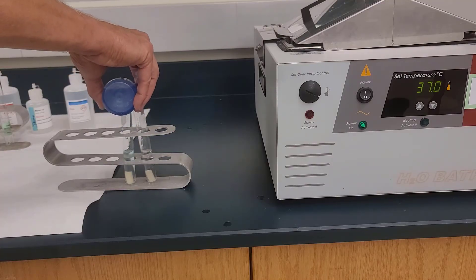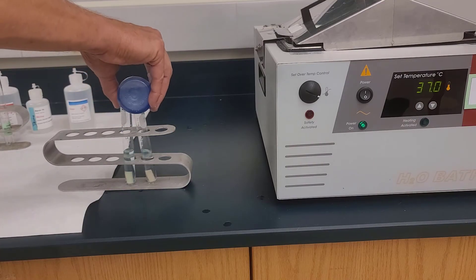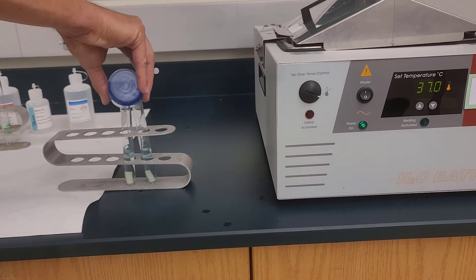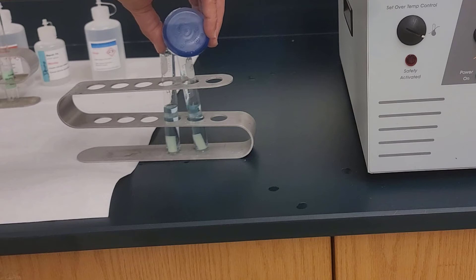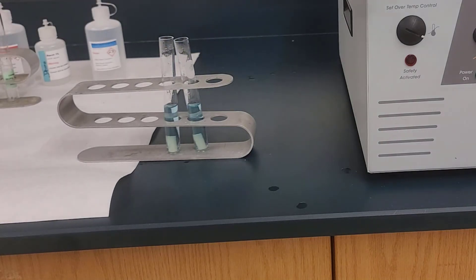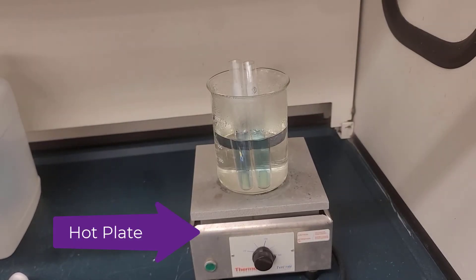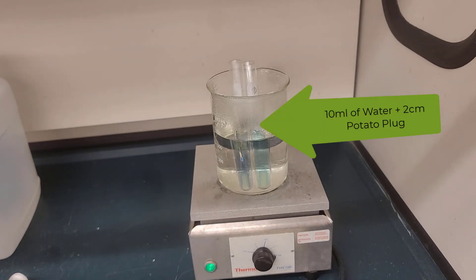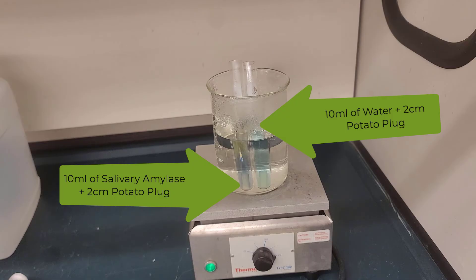Now Benedict solution is blue. So when you add blue Benedict solution to tube one and tube two, they both turn blue and they look exactly the same. But what we need to do is now put these in some hot boiling water, or close to boiling water — this is the hot water on the hot plate underneath the fume hood in our lab. So we put these two tubes in and we wait.